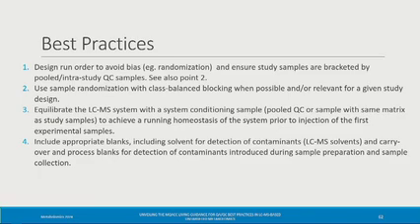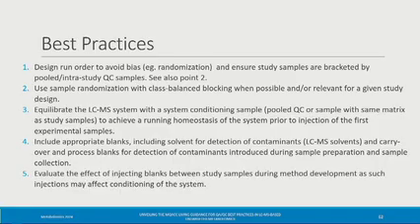We want to make sure we include appropriate blanks, including solvent blanks. We want to be able to detect carryover, and process blanks to detect any anomalies that show up during our sample preparation or sample collection, et cetera. We want to make sure that we can evaluate the effect of injecting blanks between study samples while we're doing the method development.